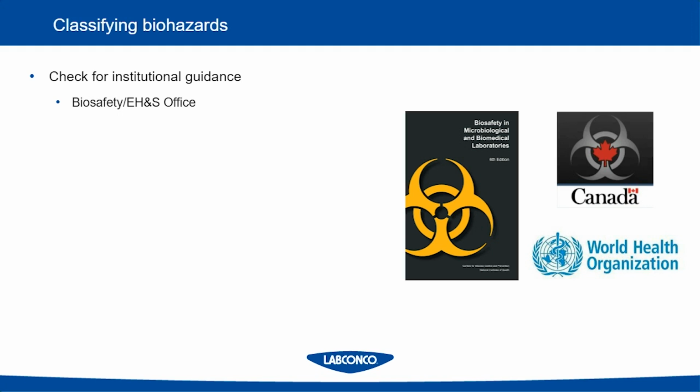But always, the first place you should go is to check to see if you have anything like that within your organization, because that's really your best in-house resource for how to handle and work with various biohazards or samples that you may want to bring into your university.